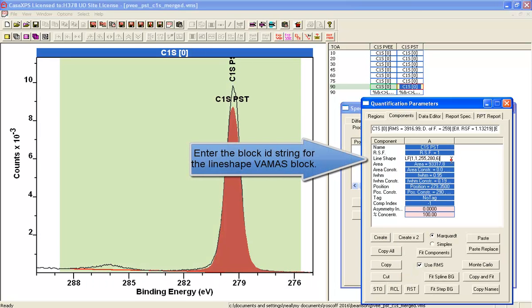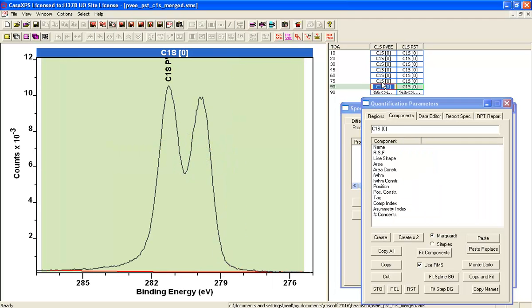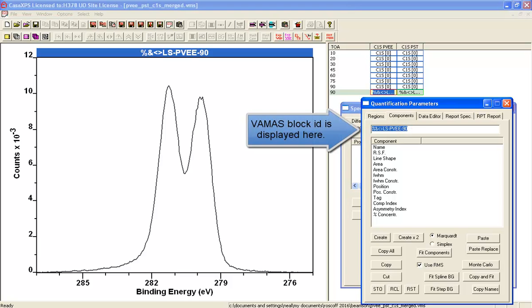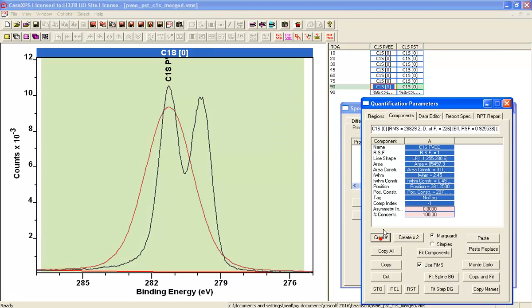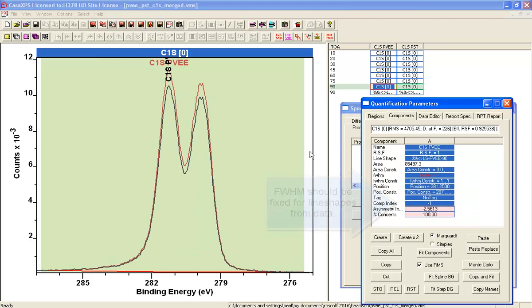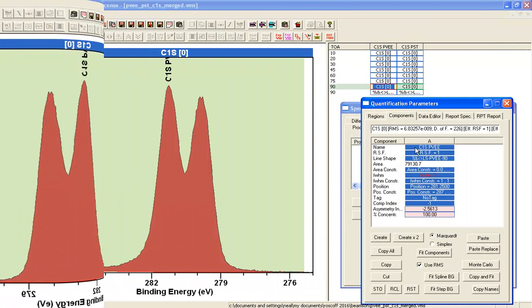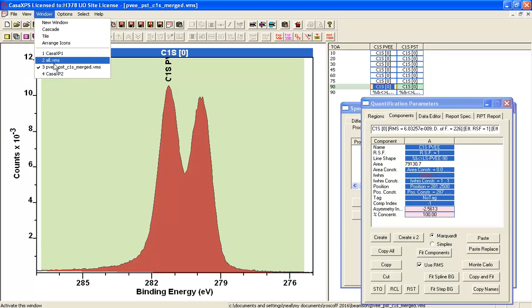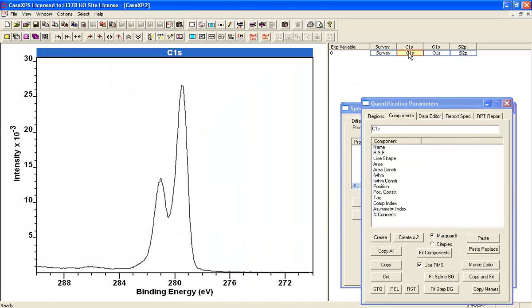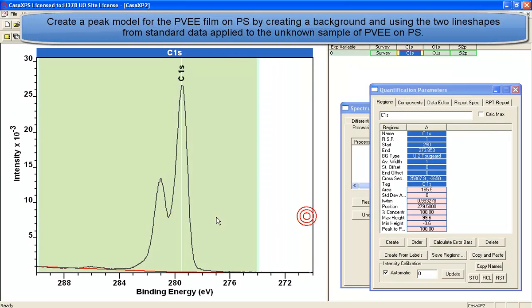And then we'll just verify that these line shapes have been calculated correctly by fitting them back to the data, which also has the effect of adding a line shape to the list of available line shapes. Once used, the line shape becomes part of the system available line shapes. So we do two functions here. That is, we check that the data is consistent with the line shape, and we also make the line shapes available for analysis elsewhere.